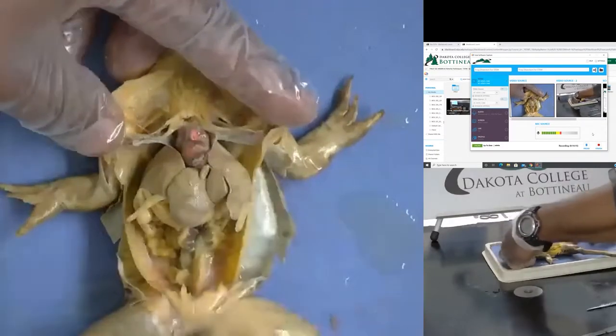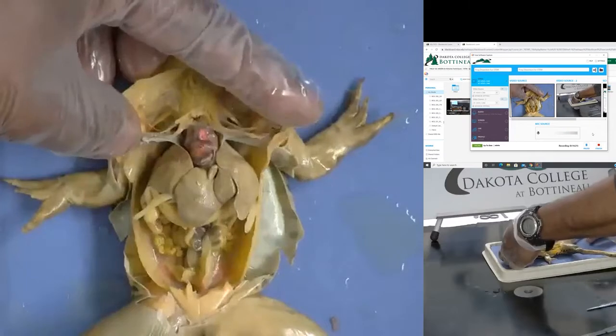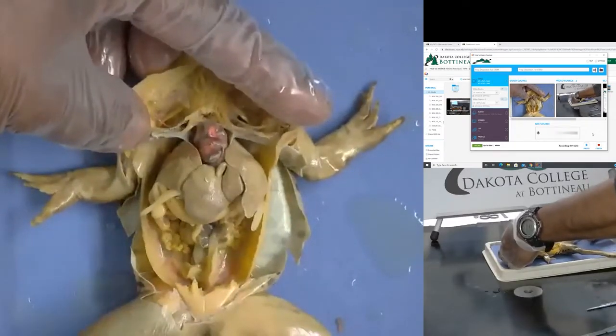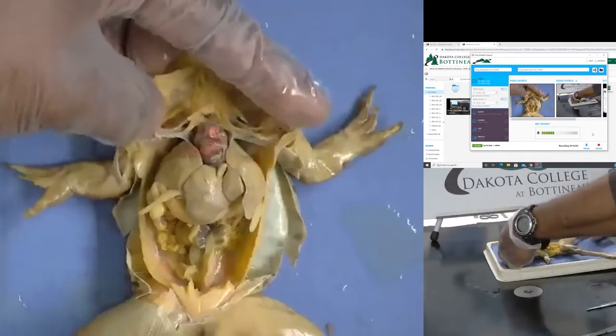So how many chambers is that? Three, right? Three chambers. So how many chambers do we humans have? In the heart, how many chambers do we have? Four. Four. So here, I want you to think a little.